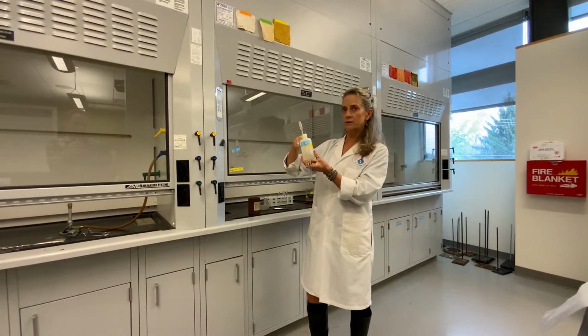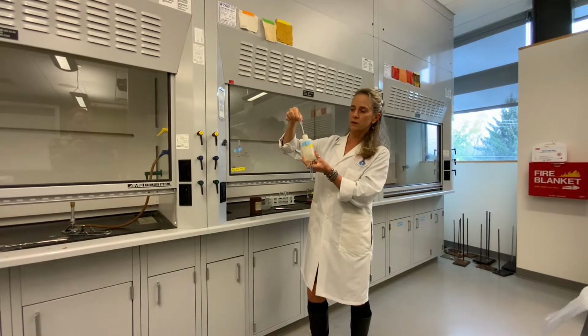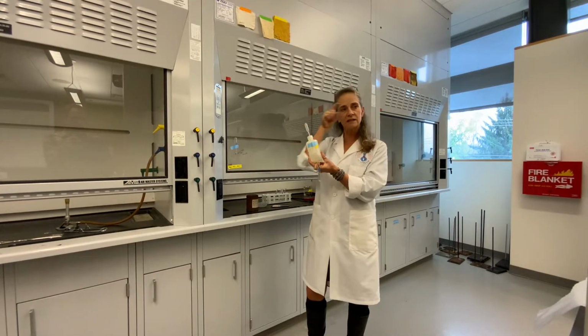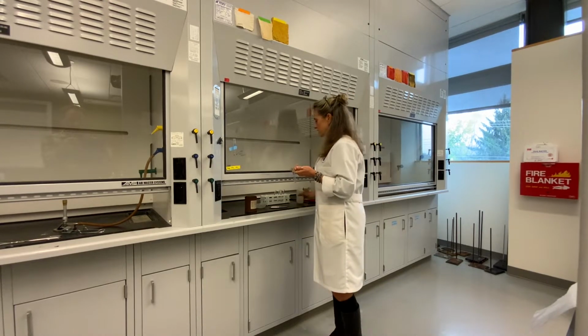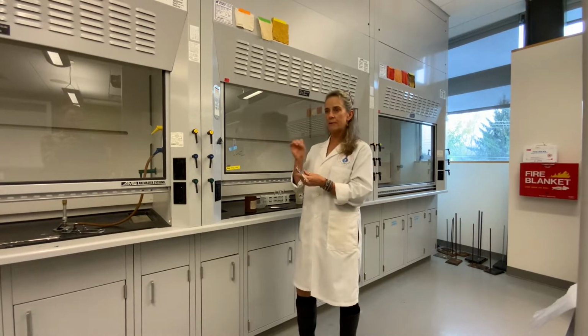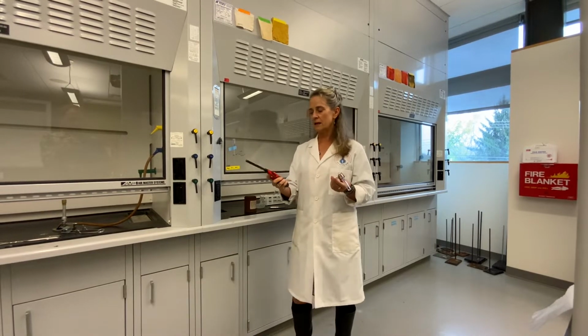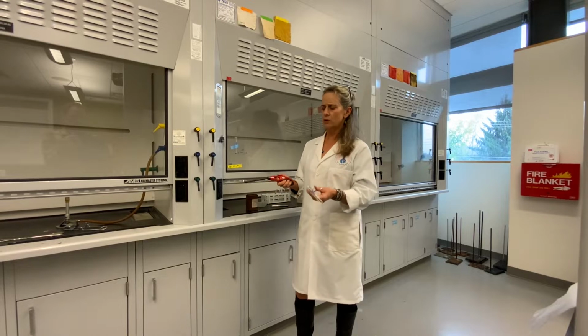Squeeze it, put it in, pull it out. You're going to have liquid in the bulb, and you practice squeezing it down to the right volume. I can tell this one is a 1 ml capacity, and that one over there is 2. Okay. So this is the reaction you're going to get. It will happen very fast. So you're going to want your partner to be really fast, meaning they're going to have the flamethrower really, really ready.